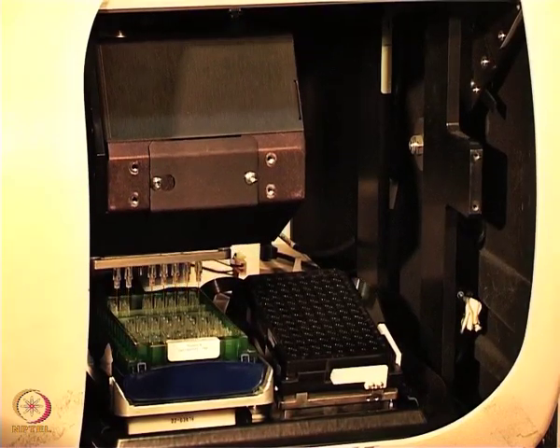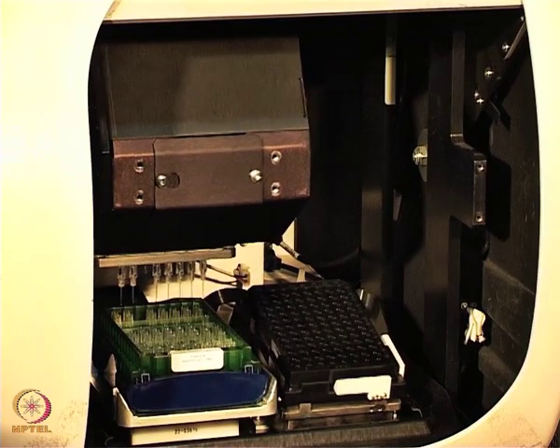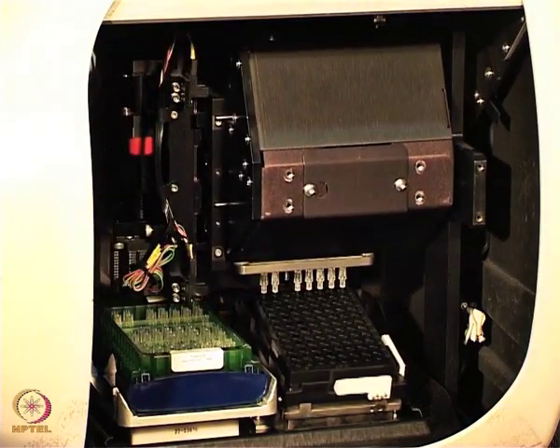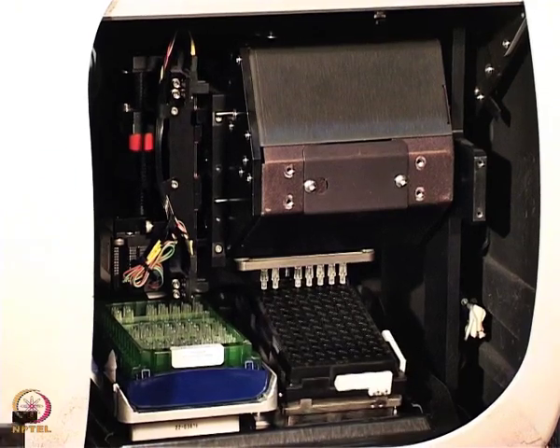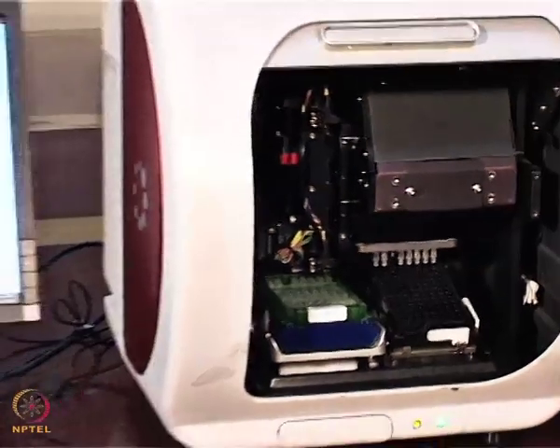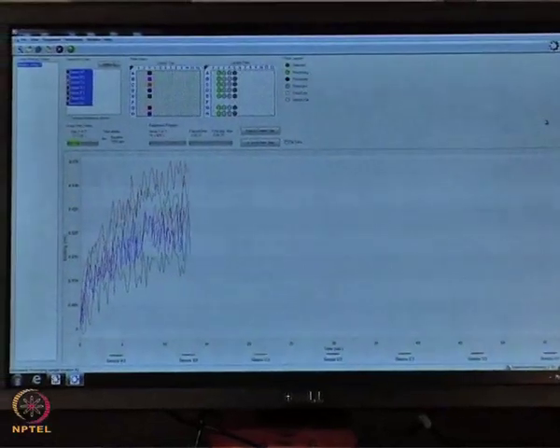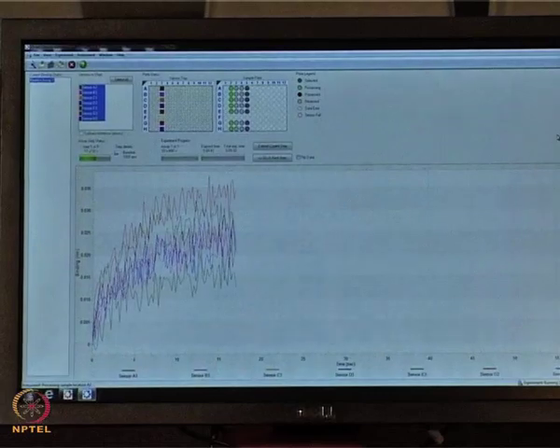The sensor is being picked from here, from the sensor rack. Now it is going to the sample plate. If you look at the sample plate now, there's a shaker working at 1000 rpm. You can see that as it dips into the sample compartment, there is a signal. Now we are acquiring this signal for 30 seconds. The first step we call the baseline.